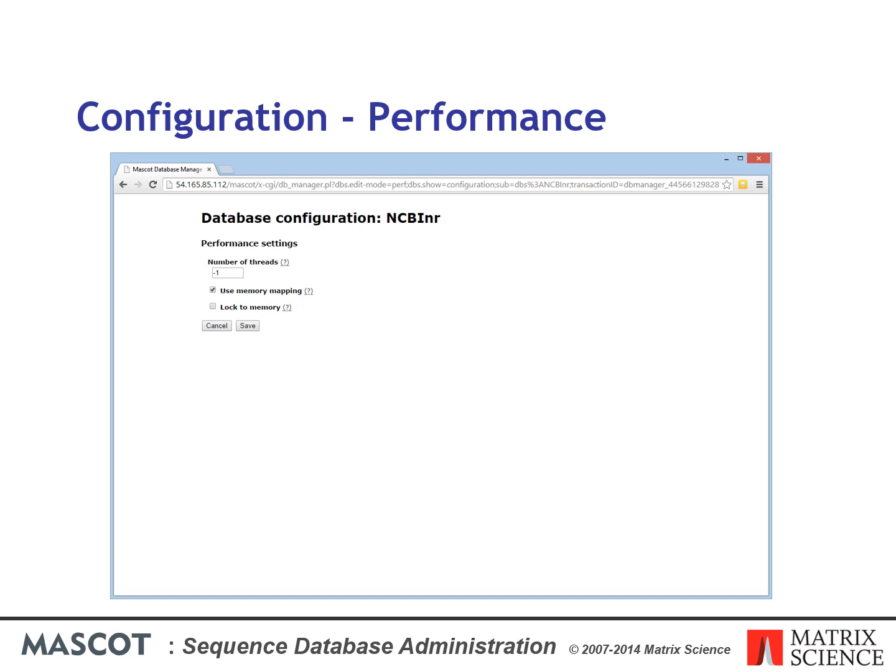A more serious problem is when there is just sufficient RAM to lock the databases, but none left over for searches or other applications. In this case, the whole system will slow down, and the hard disk will be observed to be thrashing. Eventually, the system is likely to hang or crash. In general, it is better to let the operating system manage which files are held in memory, and not to lock any databases in memory.